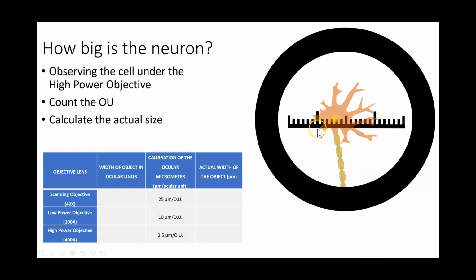And if you haven't taken anatomy yet, neurons have kind of two parts to them. They have a main body, which is called the soma, and then they have this really long tail called the axon. The axon can vary in length quite a bit. In fact, we have nerve cells that look like this that are, I think, about 1 meter long, like very, very long cells, and they can also be very short.